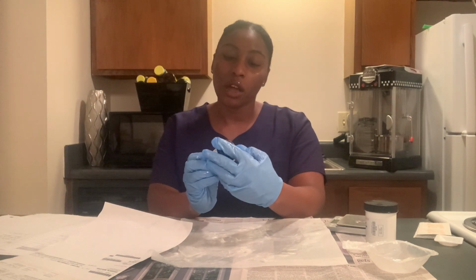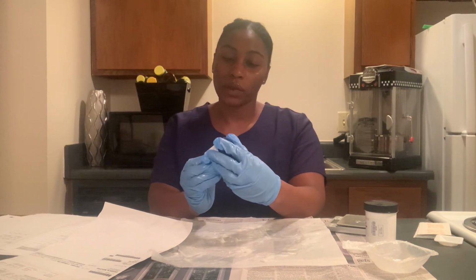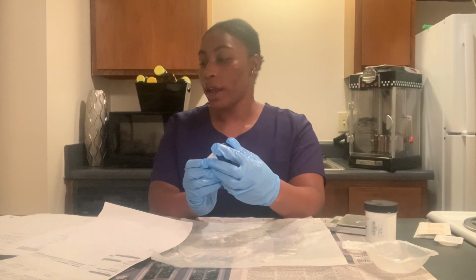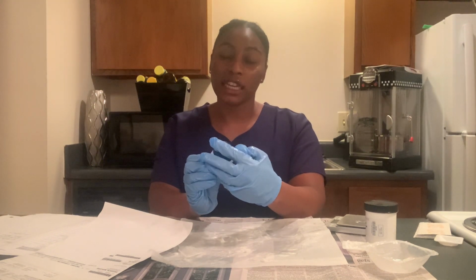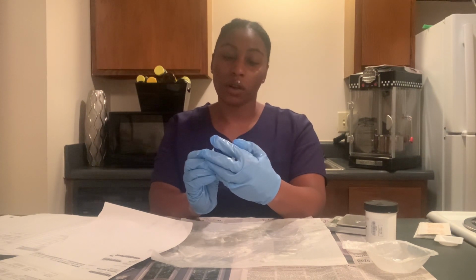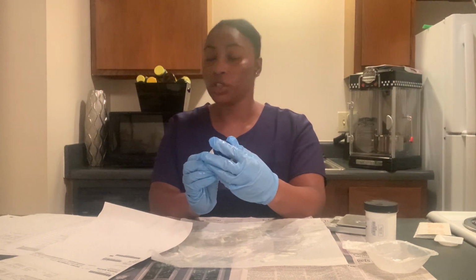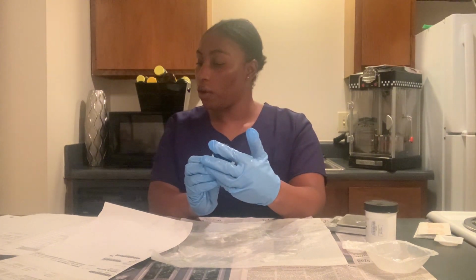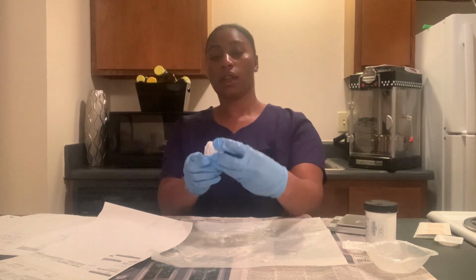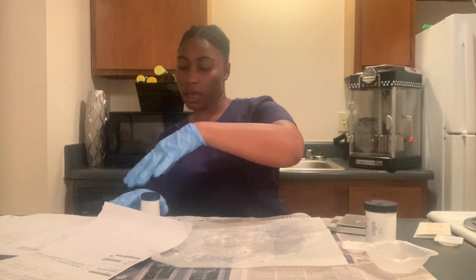So this is December 14th, 2020. So the beyond use date will be January the 13th, 2021. Okay, and this is what is on the prescription label.